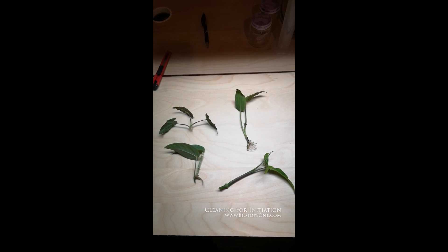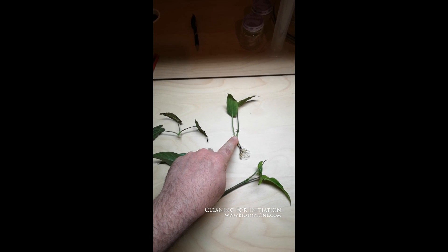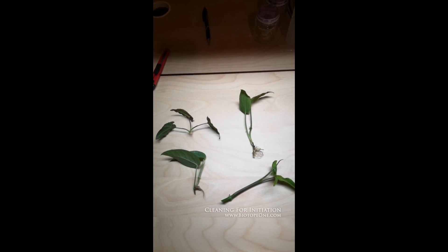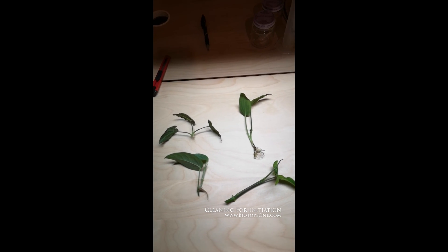I'm going to put into initiation a few aroids. One of my favorites is a Cryptocoryne here. I don't have this one in TC right now, and I'm going to clean these explants and cut them up so that I can sterilize them.